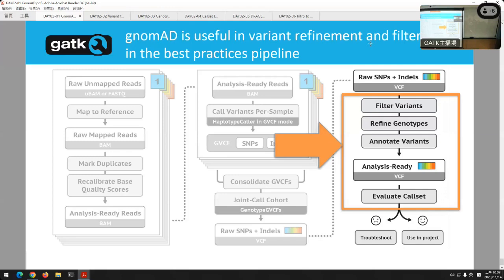Yes. So thanks for asking that because I think I wasn't totally clear. Actually, the exomes are joint called with all of the other exomes, and the genomes are joint called with all of the other genomes. But the exomes and genomes are not joint called together. Right. So that's why the browser always contains independent information from exomes and genomes, because those are actually different call sets.